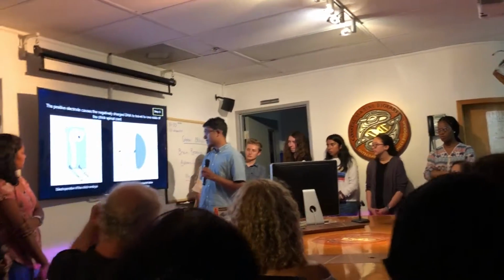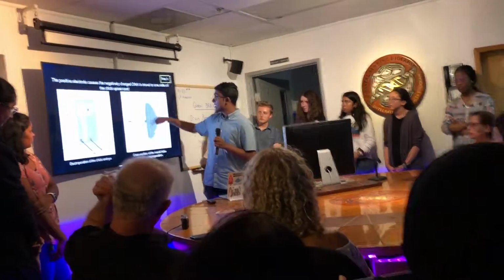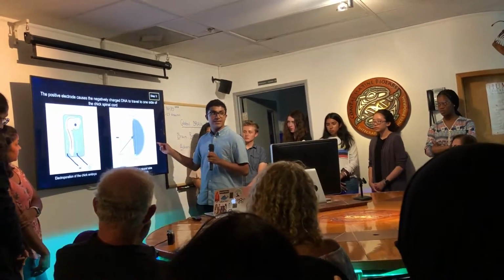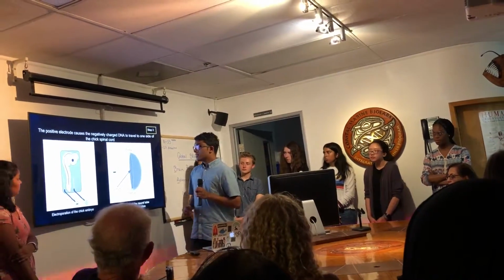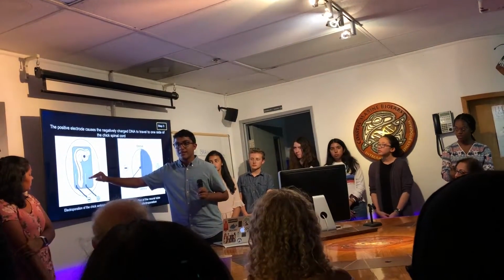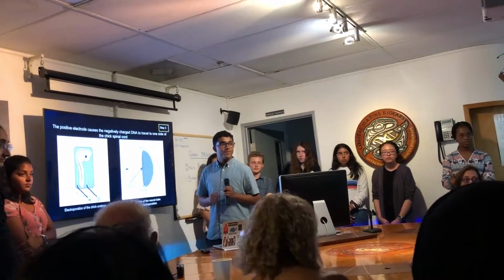This is a cross-section of the neural tube following electroporation. As you can see, indicator dye is in the lumen, and we have our destination vector in the cells nearest the positive electrode. Show us with your hand what a cross-section would be. So a cross-section, we would cut right here and then invert it. Cut this way and looking this way.